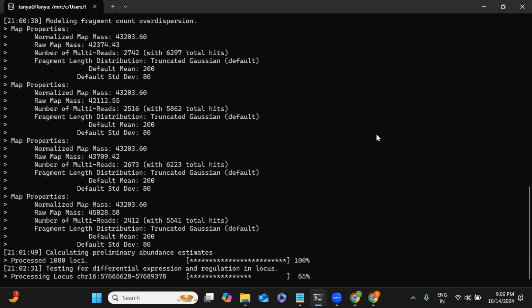Ma'am, I have edited the BAM files, so the cufflinks output that was just made, should I delete that too? Yeah, run that again. Everything you should delete and just try it again. Okay, ma'am, the BAM files are being generated now. Okay, no problem. Okay, ma'am. Thank you.